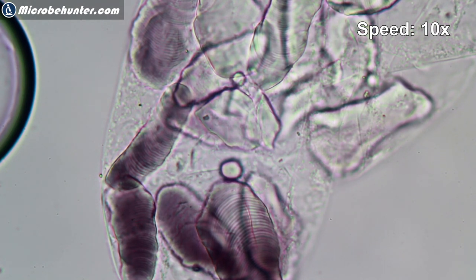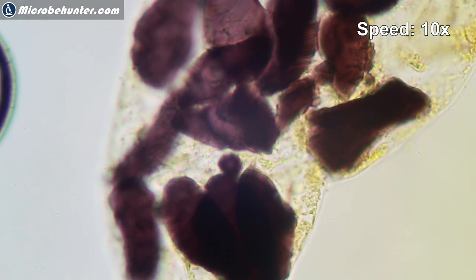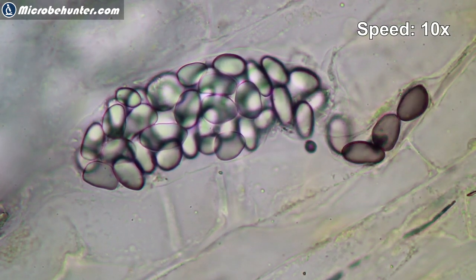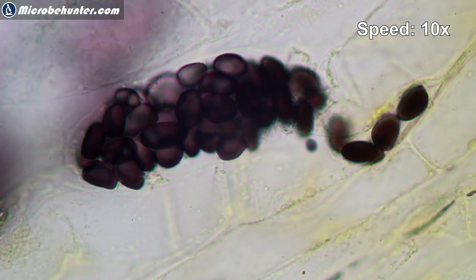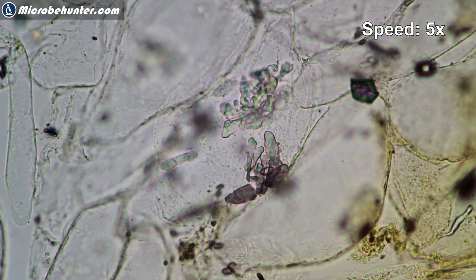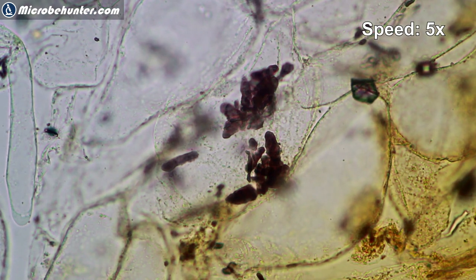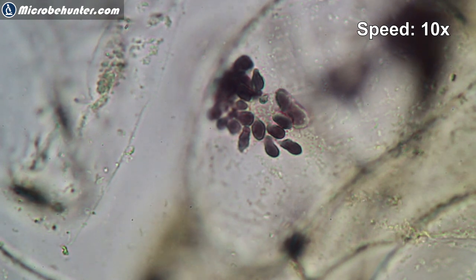Here they are under the compound microscope, and from the bottom you can already see that those starch grains are much darker — that's how they actually stain black. This is a time-lapse at 10 times speed, and as the iodine solution diffuses across the slide those starch grains start to turn black. It's very nice to see this actually happening here in time-lapse. Then only a few minutes later you also start to see the actual orange iodine coming in from the side as well.